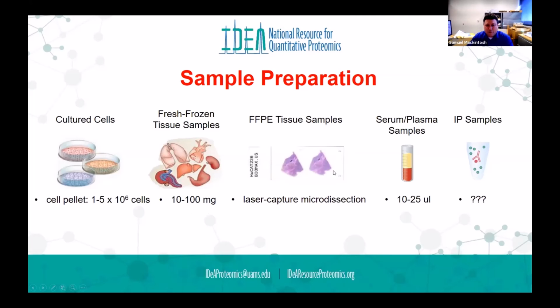There are pretty good protocols for extracting protein from those samples. If you can get a good LCM in the first place, that's probably the trickiest part, depending on your institution, the availability of the equipment, and someone who's expert enough to do it properly. If you've got that, then it's definitely a workable experiment.